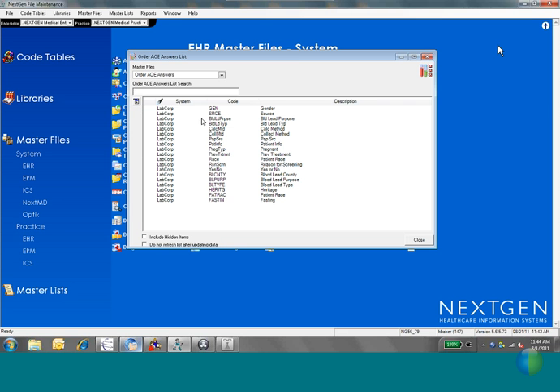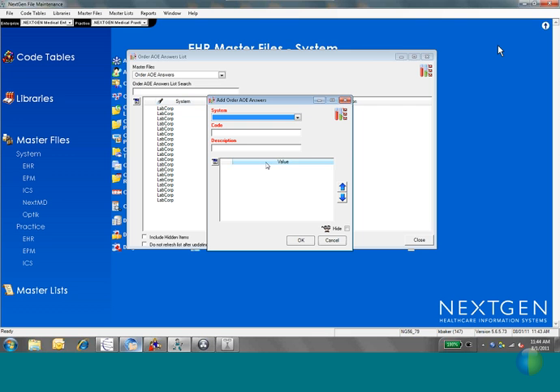So when you go to build this, it's actually very easy. I'm going to create a new one, and there's only 3 required fields. You definitely have to pick your vendor. So if I pick LabCorp again, that's my vendor. And the code and the description will match the code and the description for the question. So already what we talked about, you look at your spreadsheet and you find out your question code and your question description.